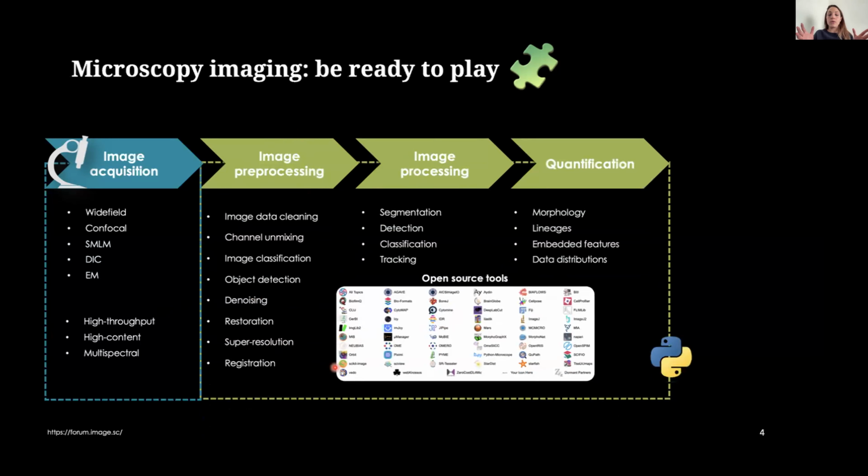And here is where we need to decide if we need to clean the images. And actually, it was very nice to have the introductory talk, because you saw how you need to pre-process all these images, right? For example, to correct color aberrations, correct the background, identify the small objects and the big ones in your image, so then you can analyze each of them independently.